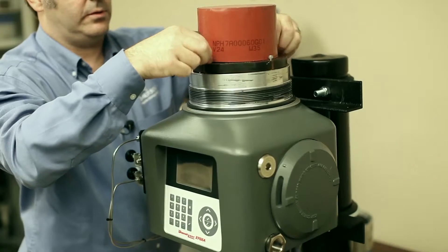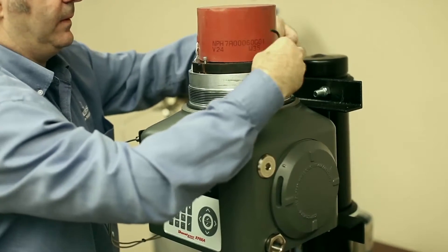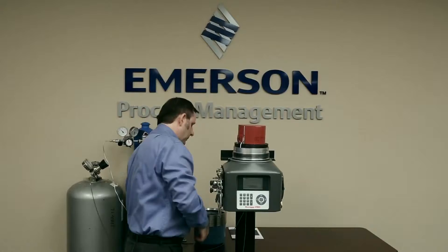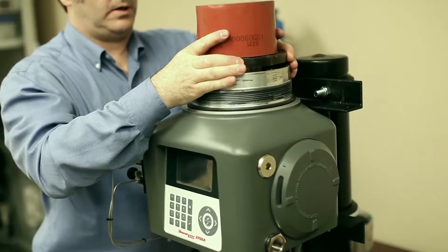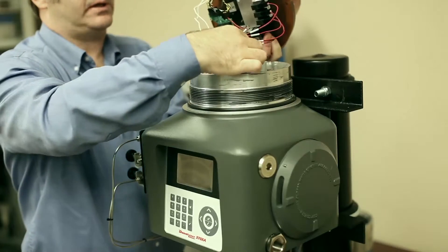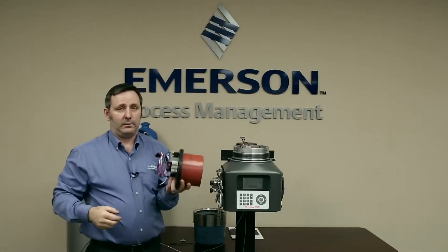Then we take off the four screws and flip them to the side. Now we're going to lift the module off — we gently rock it and lift the module off. The connectors are still going to be connected, so first we disconnect the heater, then we disconnect the solenoids, and now we disconnect the detector signal from the IMB. And now the oven is off.